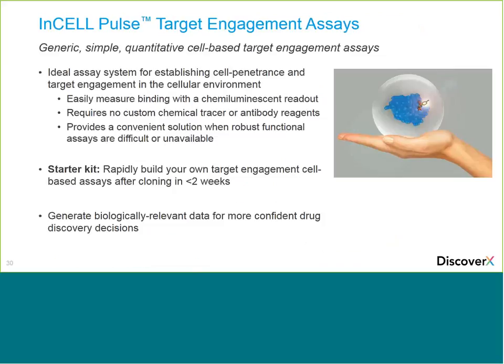So we're very excited about applying this technology to kinases and to continue working with the SGC on this. So to summarize, hopefully I've made a case that there is a role for cellular target engagement assays in multiple phases of drug discovery, independent of the drug discovery paradigm, whether it's phenotypic-based or target-based from the outset. These assays are ideal for establishing that compounds are cell penetrant and get into a cell. And really, I think one of the main value propositions is that the assays have a very simple readout.